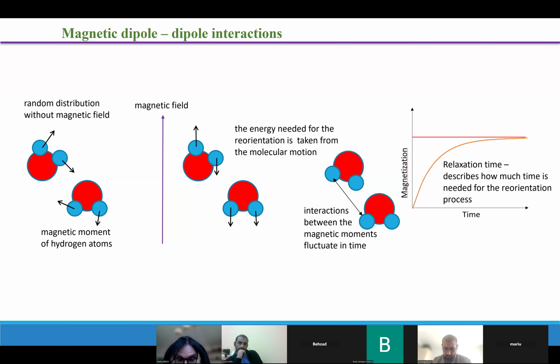The second quantity is called rotational correlation time, and it describes how fast molecules rotate. We didn't talk much about the rotation dynamics, and this can be again a kind of confusion. But imagine again those people in a room which move in all possible directions, and there's a lot of people, so they jump into each other all the time, yeah? With quite a lot of force.